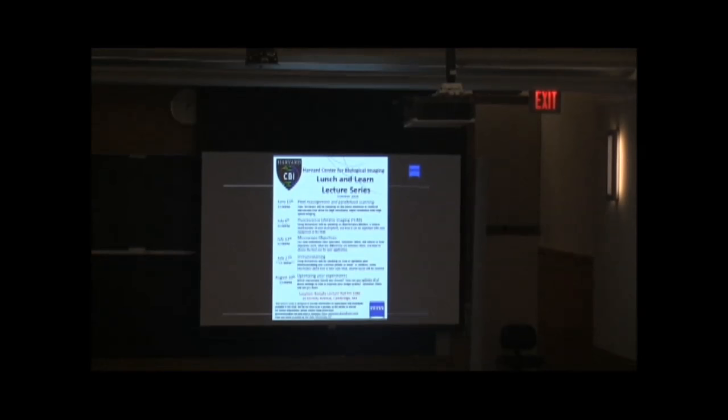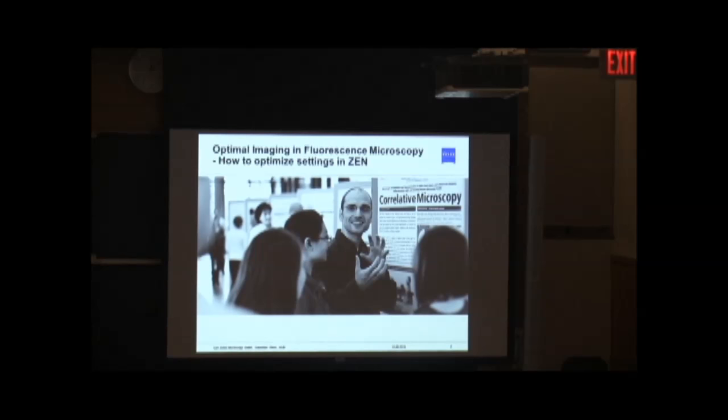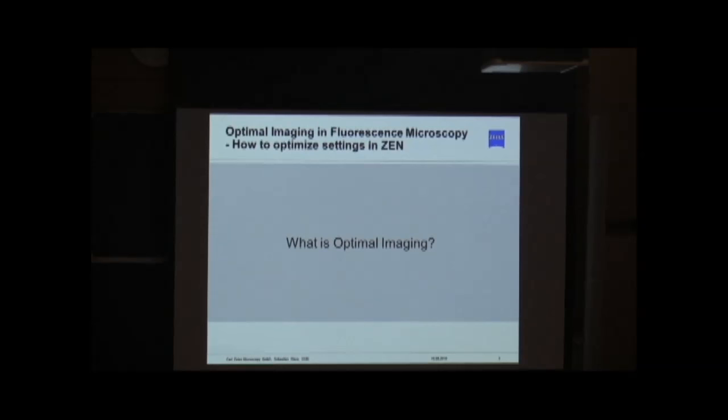Right, so thanks everyone for attending this last discussion of our series. The topic is optimal imaging in fluorescent microscopy, how to optimize your settings in our beloved software. And let's start with the question, what does optimal imaging actually mean? If I was asked that question, I guess most of you would give me a slightly different answer, because all of you have different ideas in terms of optimizing the imaging.